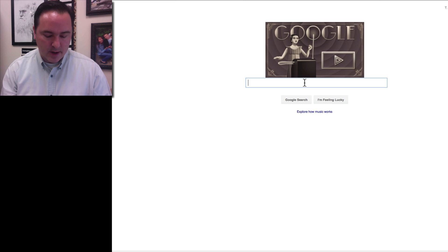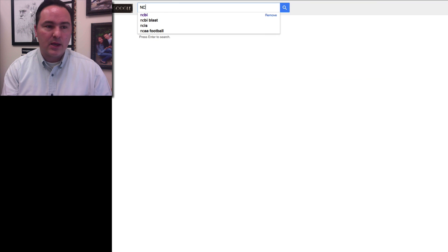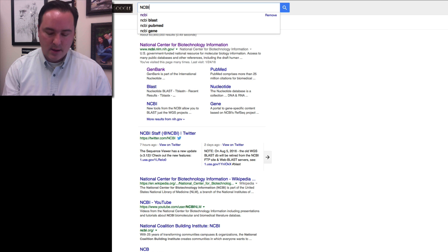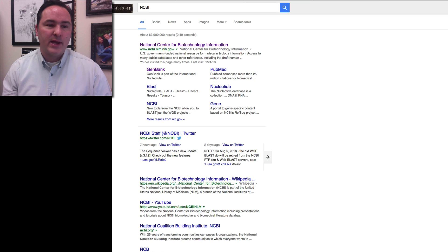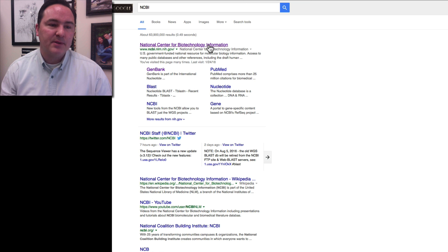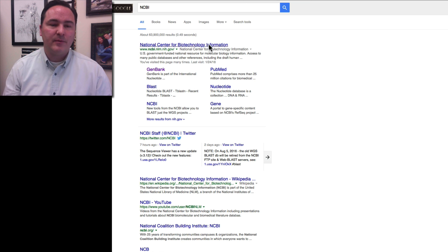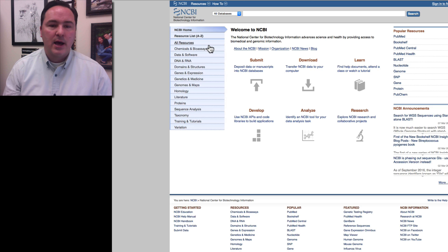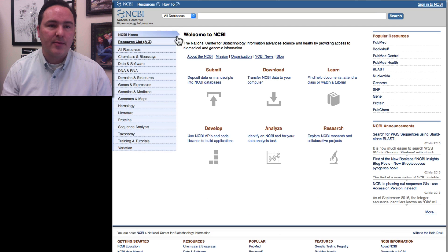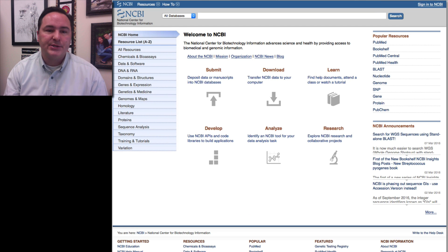Okay, so here I am on a browser. I'm going to put NCBI, and if I put NCBI, the very first hit that comes up is National Center for Biotechnology Information. I can click on that, and it brings us to this webpage.